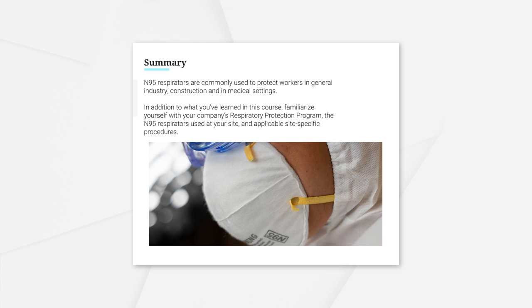N95 respirators are commonly used to protect workers in general industry, construction, and in medical settings. In addition to what you've learned in this course, familiarize yourself with your company's respiratory protection program, the N95 respirators used at your site, and applicable site-specific procedures.